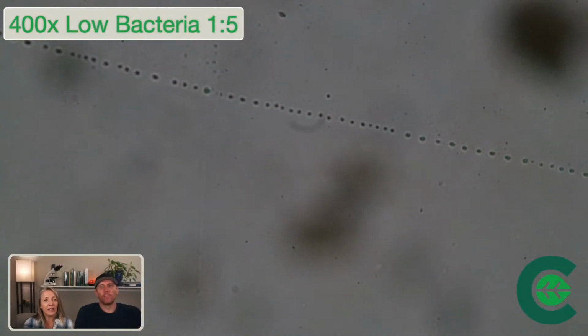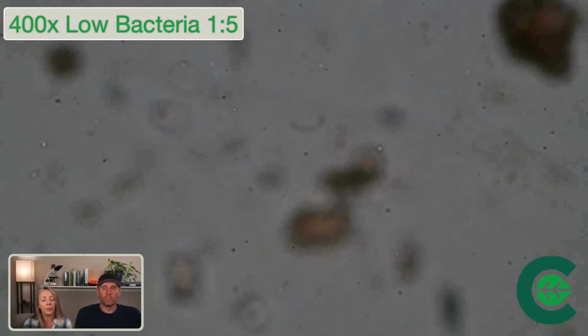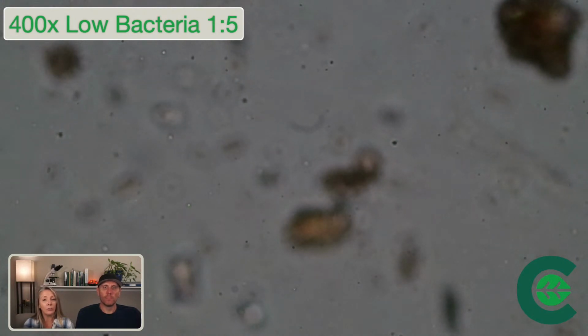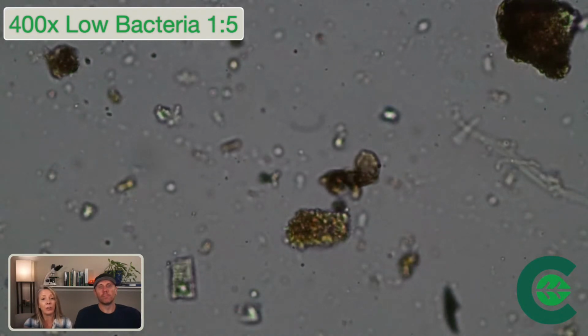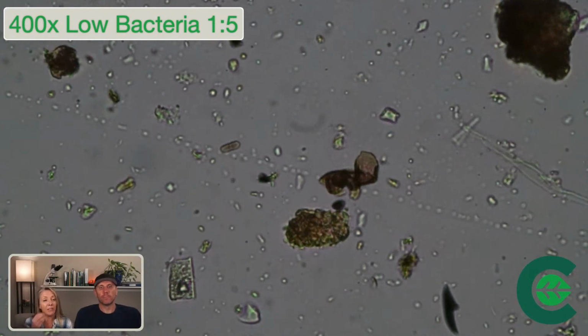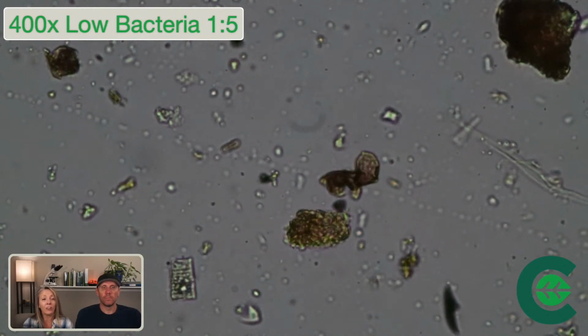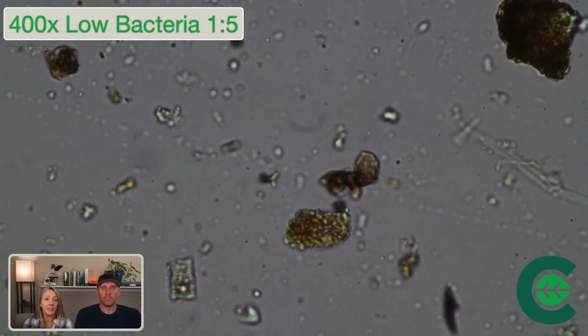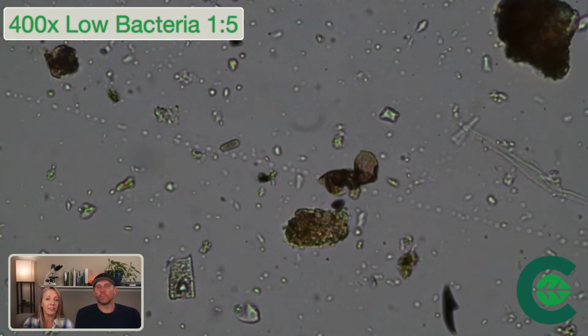And so here we are again at another sample, just trying to show differences. So this is still at 1 to 5 dilution. If you were learning to count your organisms, this would not be where you make your count. But at this total magnification and this dilution, this is far different levels of bacteria in this soil than obviously the previous soil, even at the 1 to 10 dilution.